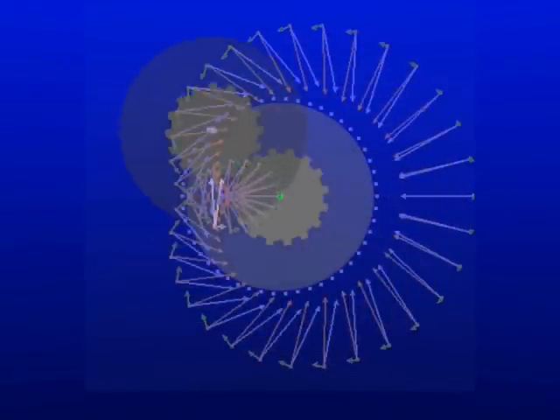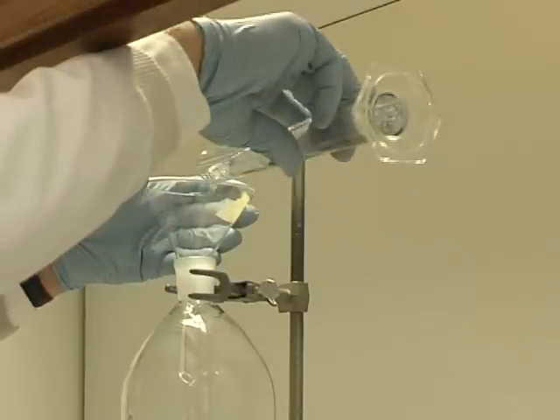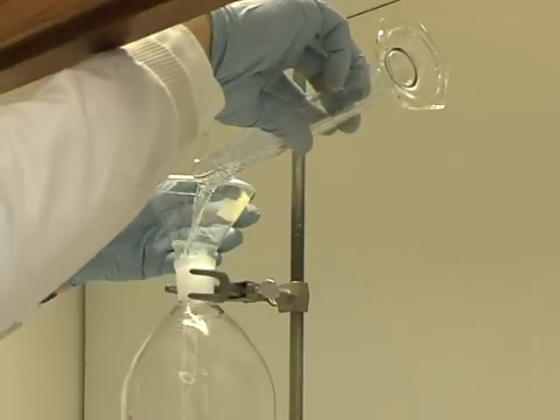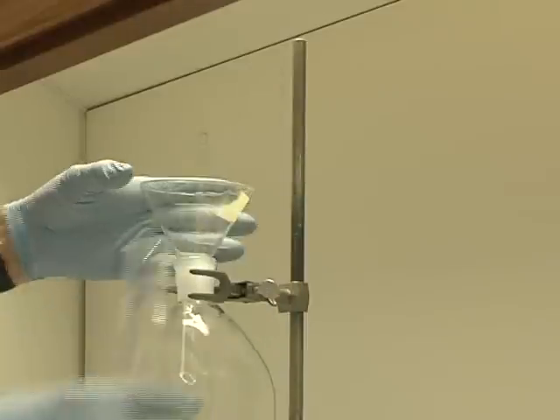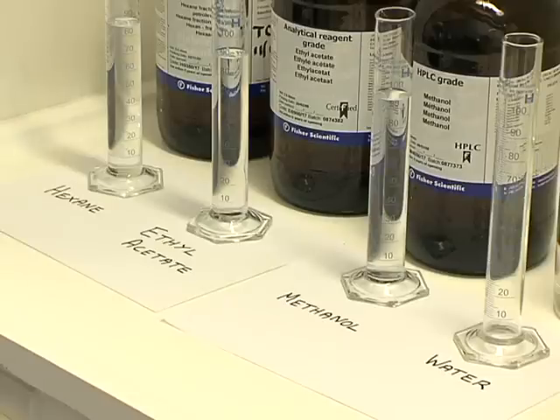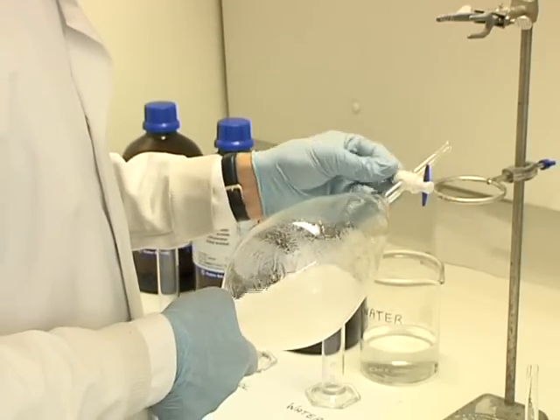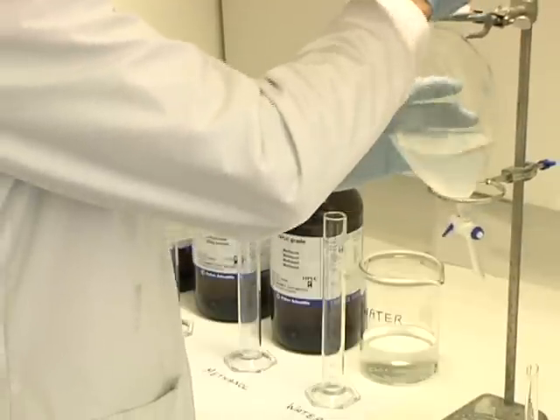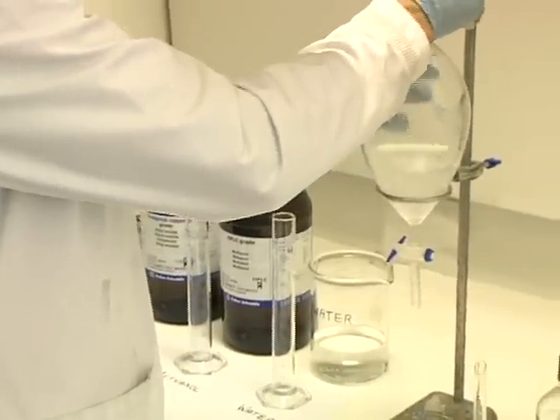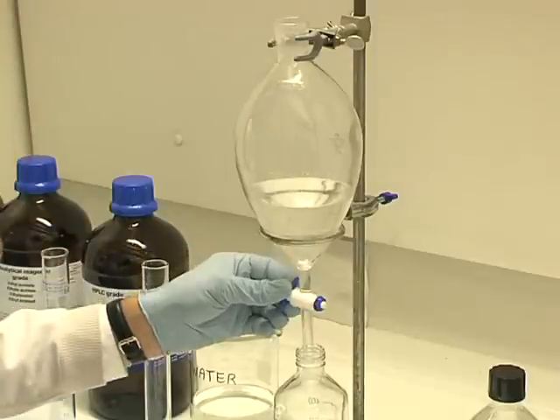A two-phase solvent system is placed inside the coil. A simple example of such a system would be heptane and water, but a more likely system for a purification might consist of heptane, ethyl acetate, methanol, and water. This gives a two-phase system with an upper organic layer consisting mainly of heptane and ethyl acetate, and a lower aqueous layer consisting mainly of methanol and water.